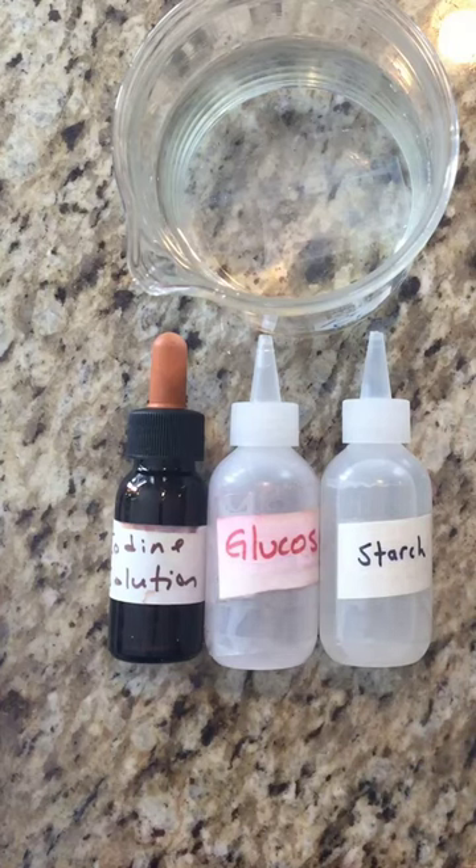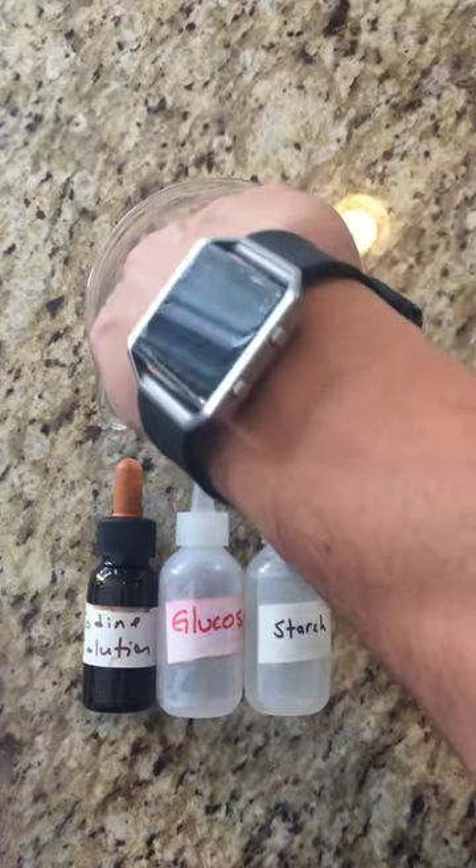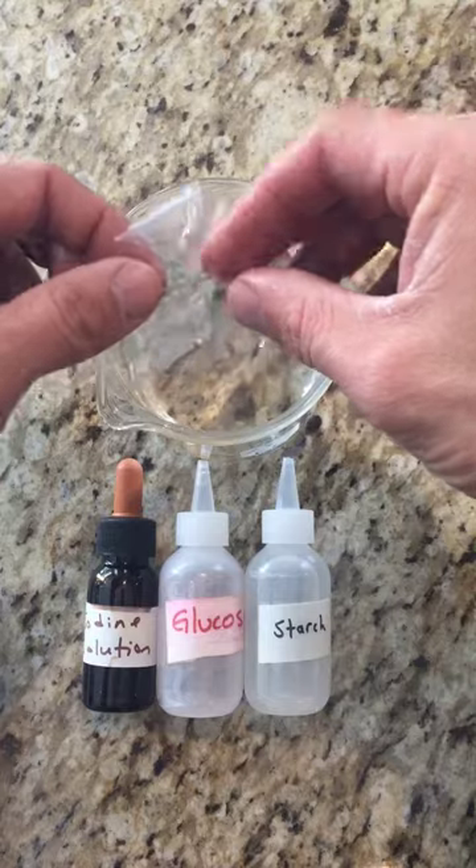The dialysis tubing is kept in the beaker here to keep it wet, but you'll get it from somewhere in the classroom. So first things first, you're going to take your dialysis tubing, which is this plastic tubing, and you have to tie off one end of it.